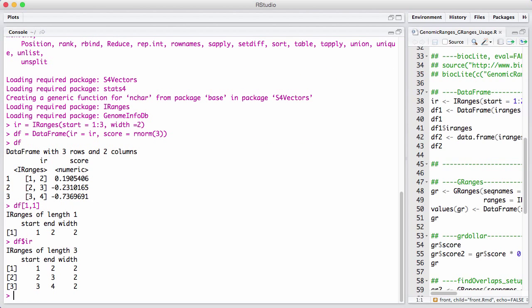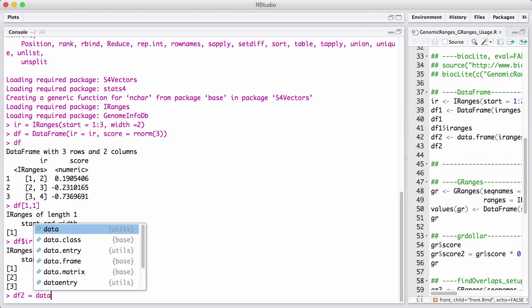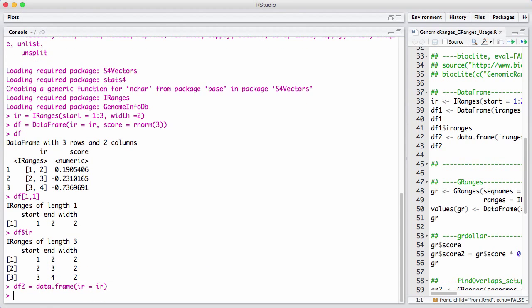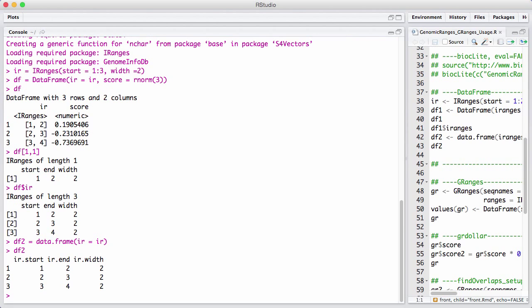This is in contrast to what happens with a classic data.frame. If we put an IRange inside a classic data.frame, we'll see that it works, but it really gives us three different columns — it doesn't keep the things together. So capital DataFrames are slightly more versatile, and for this reason they are used in various places in Bioconductor nowadays.